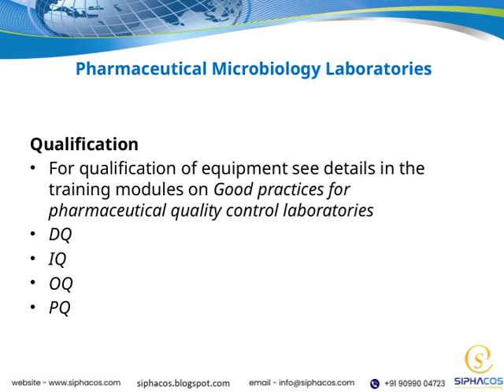Next is installation qualification, IQ, where we verify that the equipment has been installed correctly and according to specifications. Following that is operational qualification, OQ, which tests whether the equipment functions properly within defined parameters. And finally, performance qualification, PQ, confirms that the equipment consistently performs effectively under real-world conditions.